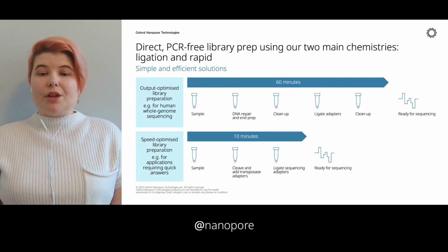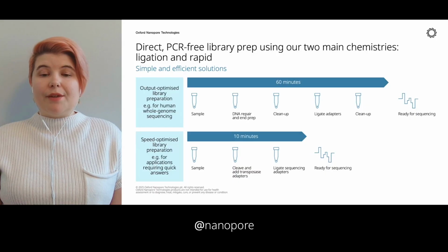Many areas of the genome are inaccessible to sequencing by amplification-based approaches. PCR prefers GC-neutral areas of DNA and preferentially amplifies shorter DNA fragments. While this is fine for targeted approaches, when examining a genome via amplification, these factors result in longer or GC-rich PCR templates amplifying less efficiently, or not at all.